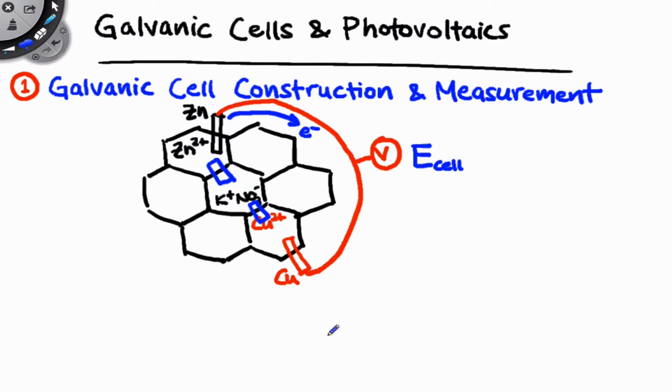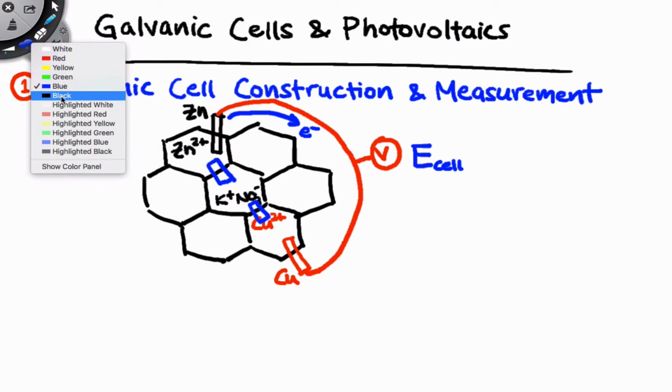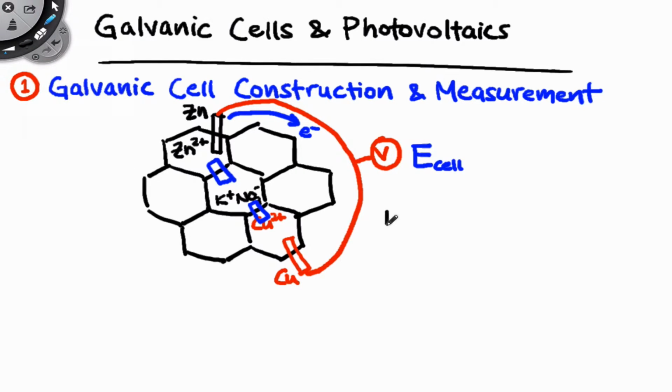So we're going to do this for a series of half cells where we're varying not only the components of the half cell, but also the concentrations. So one other thing to think about here is what happens when, for example, we convert the concentration of Zn2+, say, from the standard 1.0 mole per liter value to 0.1 moles per liter. What happens when we do the same for copper? We're going to measure these effects and compare them to theoretical predictions in this experiment.